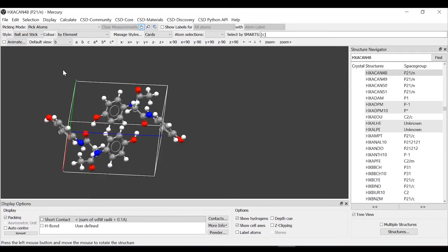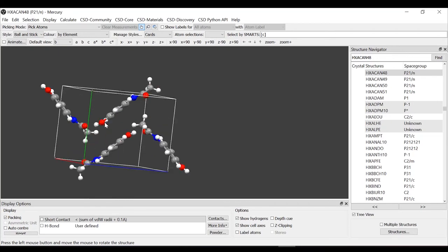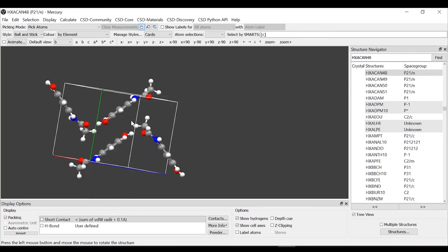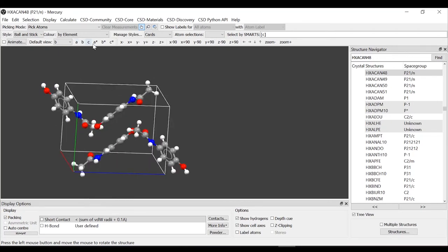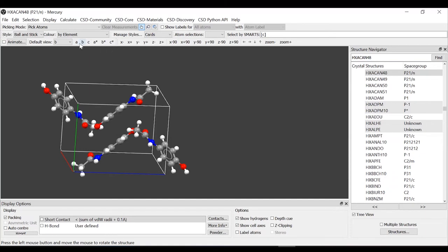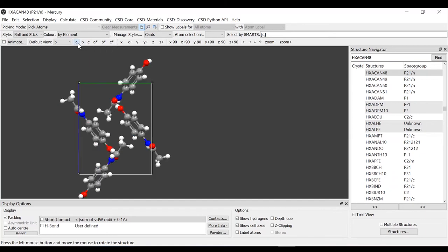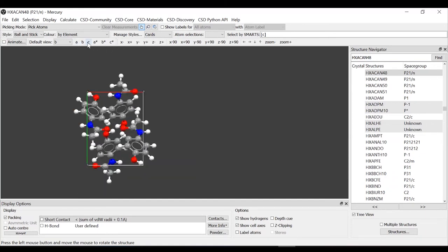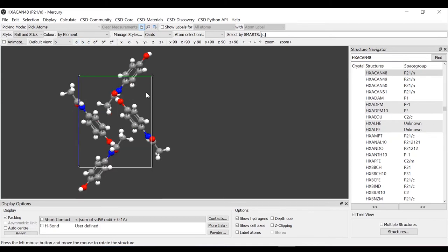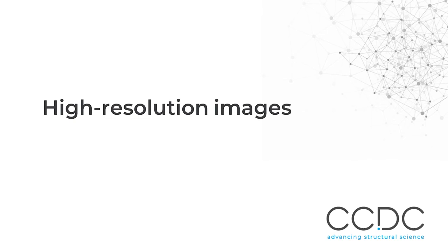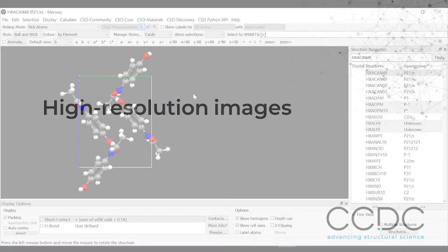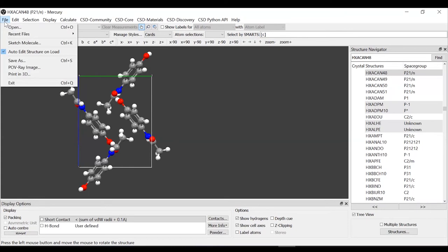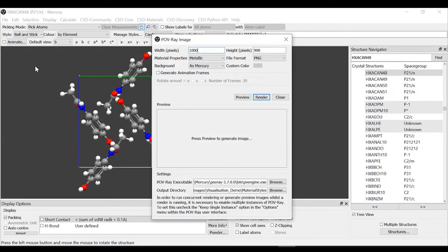The next thing we want to do is to find a nice representation of the unit cell to create a high resolution image. You can rotate the structure to find the orientation that you prefer, but you can also use these options here, which means view down crystallography A axis, B or C axis. If you click on it, it will align the representation. We will choose along the A axis.